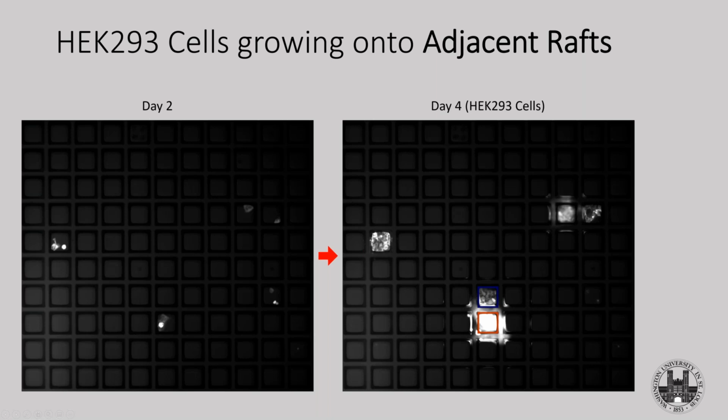And then this one got picked into a lysis buffer. This one got picked onto a plate. Up here is an example of a colony that we wouldn't pick because we can see it came from 2 separate cells. And so again, we can get to the genotyping stage in just 6 days, and this is really wonderful. It's really helped a lot of things that we do.